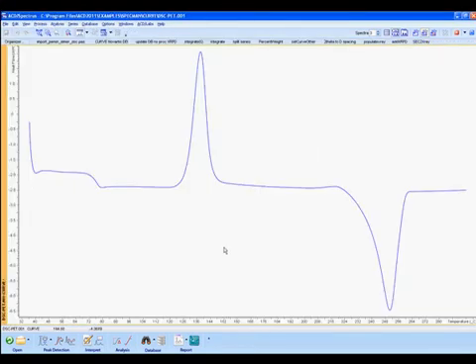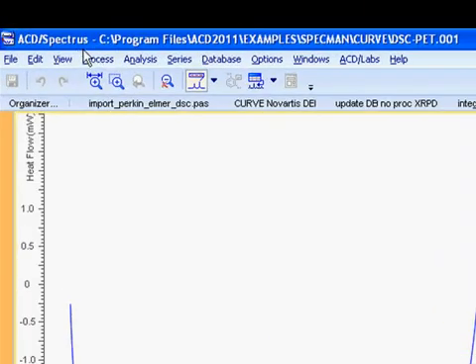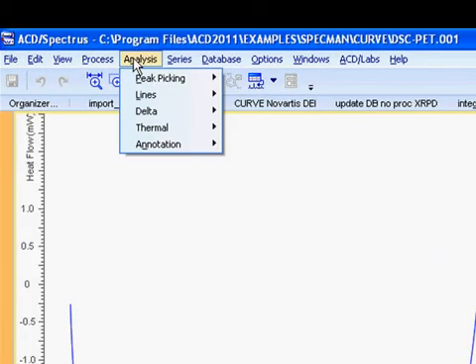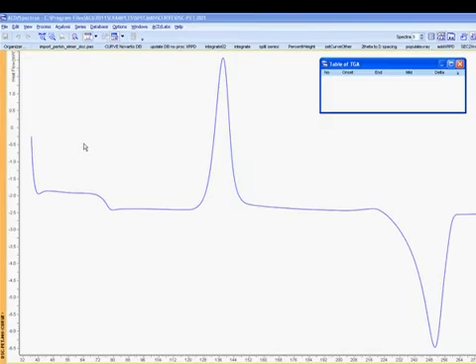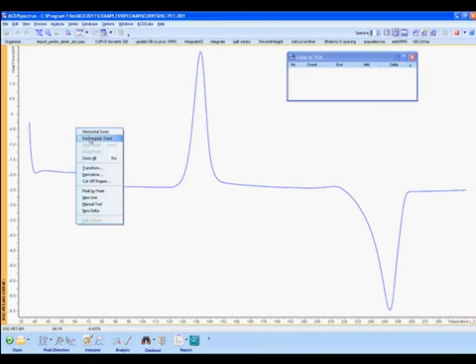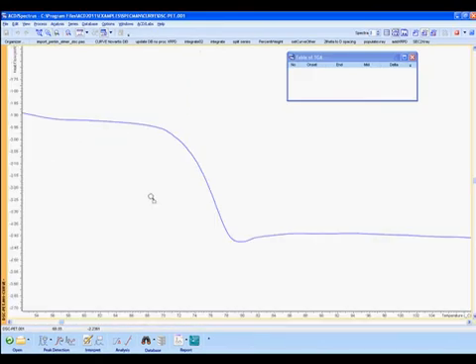The thermo-gravimetric analysis tools can be accessed through Analyze, Thermal, TGA Path. We'll use a rectangular zoom to focus on one section of the curve.